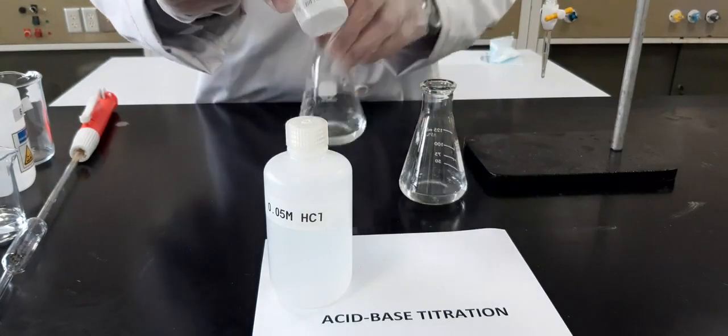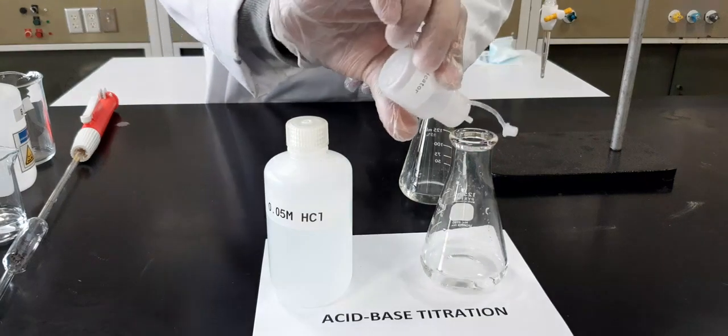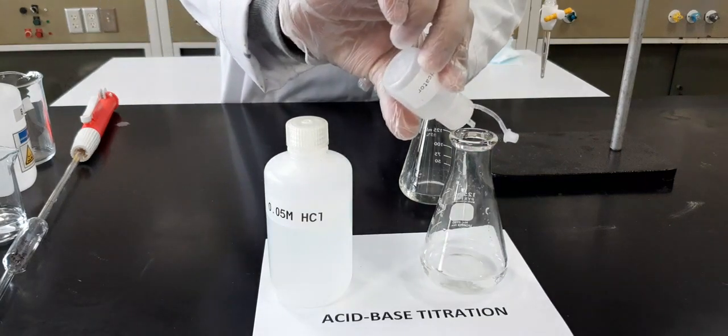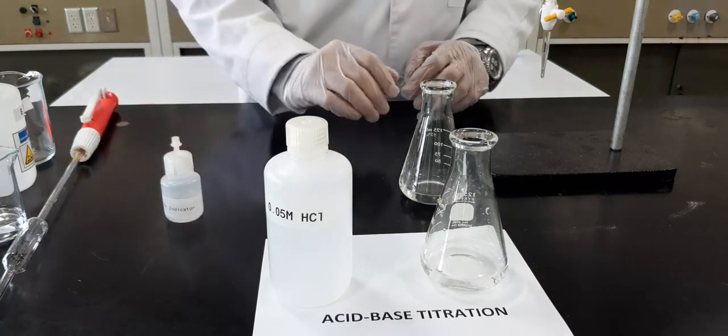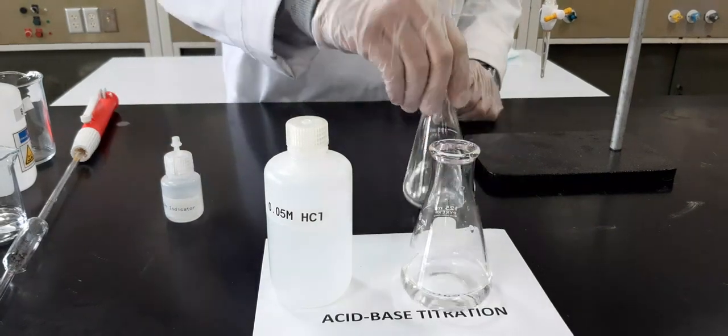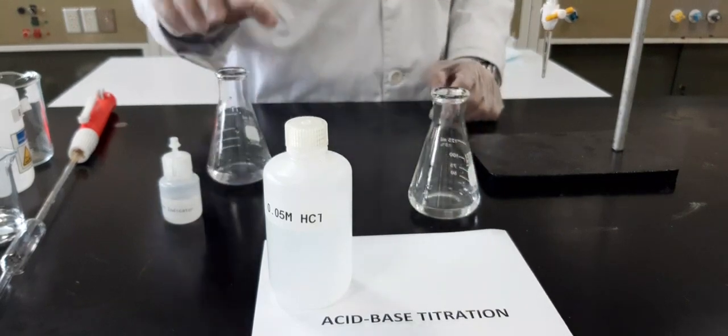Now for the other flask we will do the same. Don't forget to add indicator. If you forget to add indicator, you will not see any color change. So we will mix it. Now our process is ready. We will go for the titration.